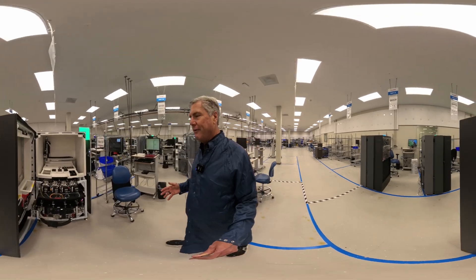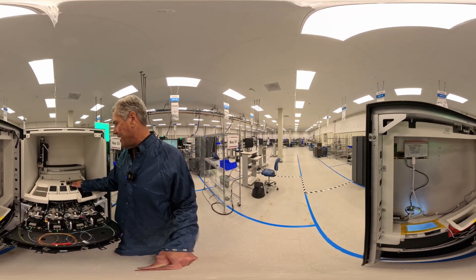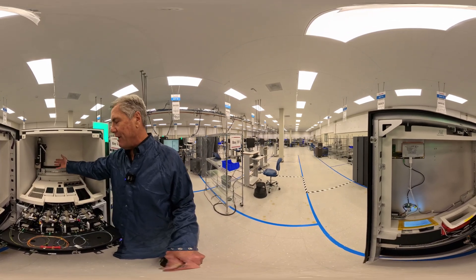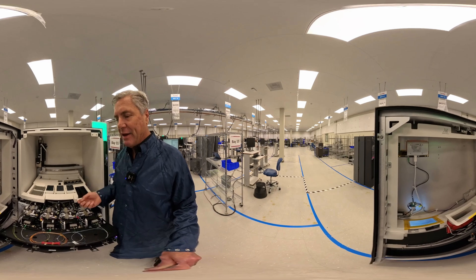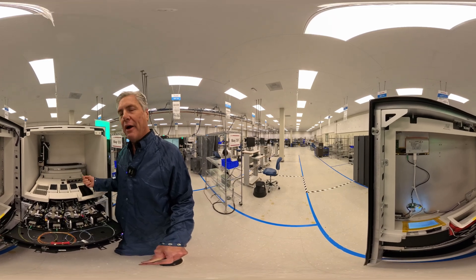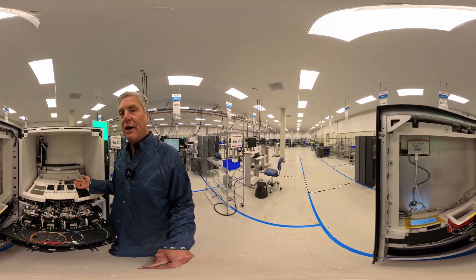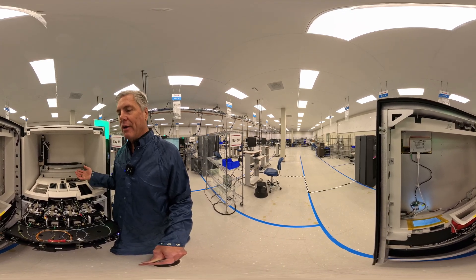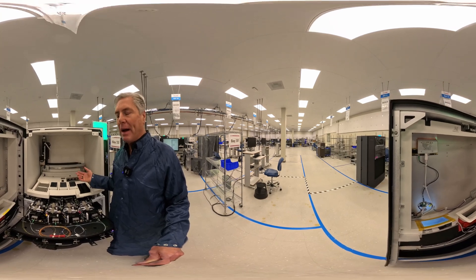Here's an instrument right now. At the top we have the work deck with positions for all of the smart cells across the top, and the robot that moves the smart cells and all of the reagents. It's a really simplified work deck compared to prior generations. Revio produces 15 times more data than any other PacBio sequencing platform ever created, and in fact Revio has been the fastest product launch in the history of the company. When it launched and we started shipping last year, we had an incredible amount of demand that has really changed how people think about PacBio and long-read sequencing.